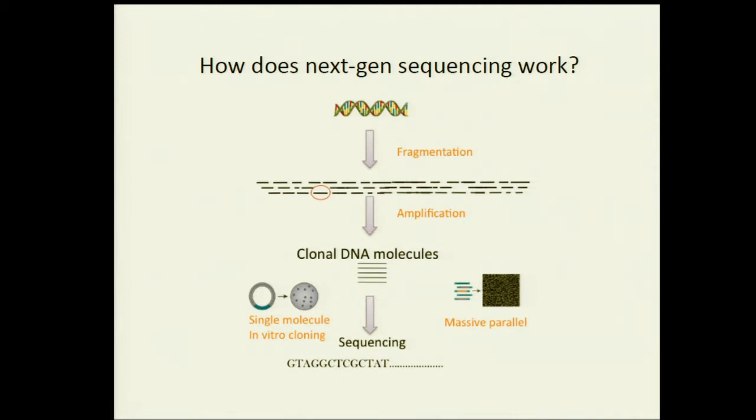But generally, today, we're talking about reads, for example, with Illumina sequencing, of let's say 100 base pairs. So you have a 3 billion base pair genome, and this is one little snippet, one little window into the piece of DNA. Those things get amplified, and we'll move down here, and massively parallelized, sequenced on the machines. What you have is a file that contains the base pairs that correspond to all these little windows.